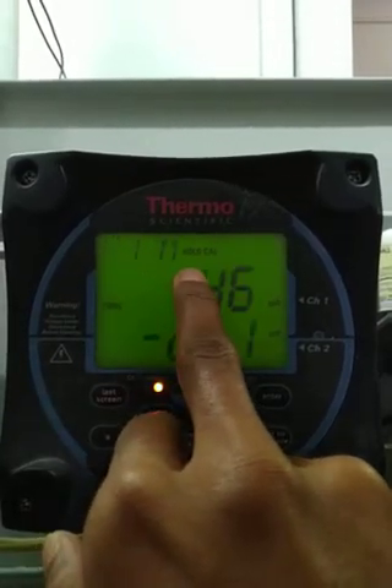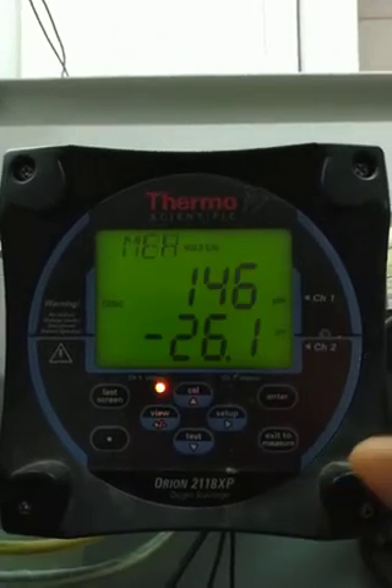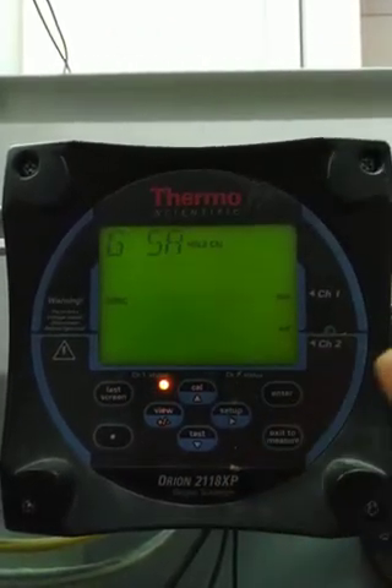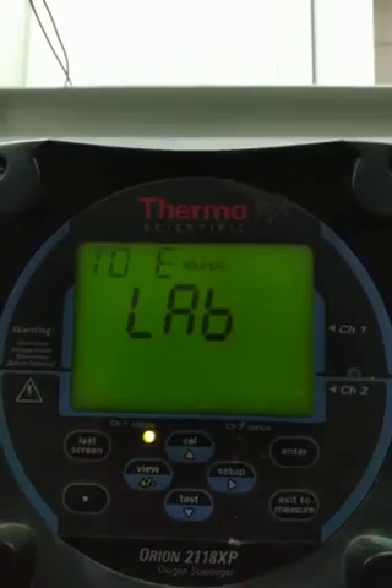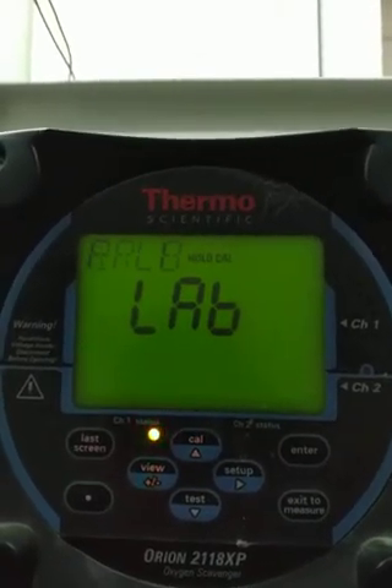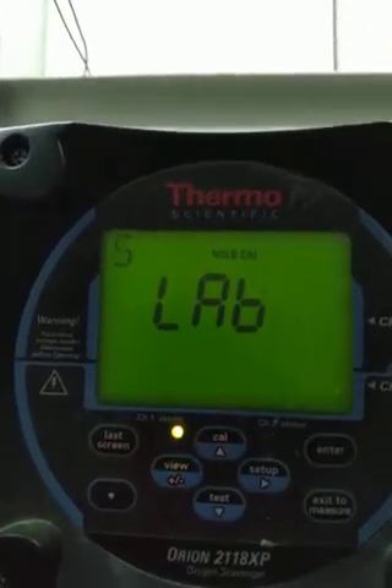It says wait one minute — it will be stable. Now it will blink, but when it becomes stable, the calibration will be passed. Now it will be stable. Now we will do the leak test.